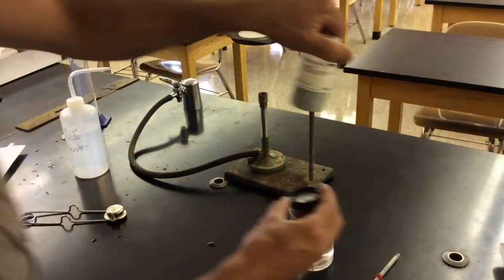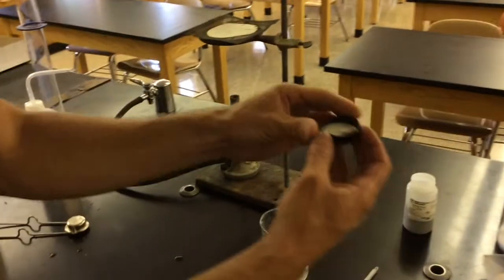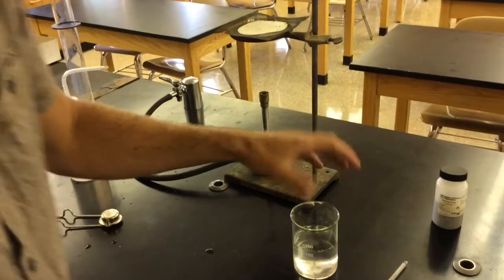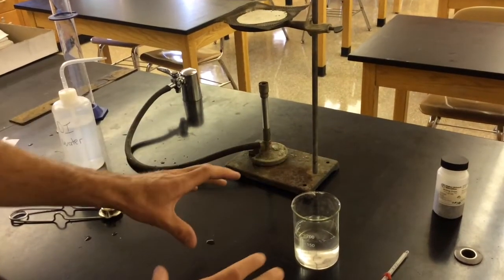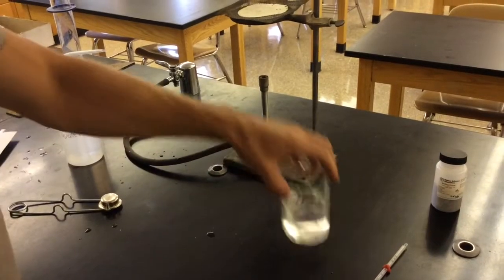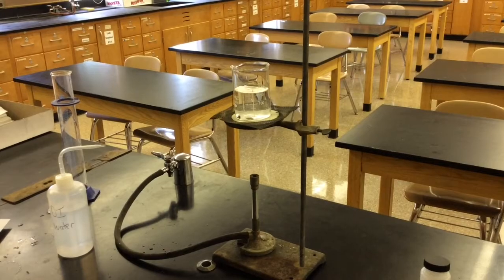Add in boiling chips. Boiling chips promote smooth boiling. These do not dissolve, so we're going to collect these back. Two usually does a good trick. And what happens is, instead of getting one large bubble of steam, you get a bunch of small bubbles forming around those boiling chips, so it works pretty well. So now we know the ring stand is set up well.